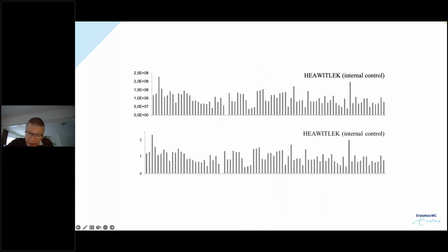Of course, these kinds of samples can have different amounts of protein, so we use a kind of standard peptide, which is always present in this kind of sample, and then we have an idea if enough protein is loaded. You can see there are some holes in it, so these kinds of samples would be excluded. For this whole series, we found one more or less in the middle with a very low concentration, so that can be excluded. Next slide, please.